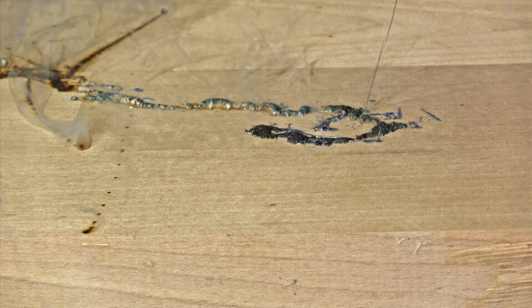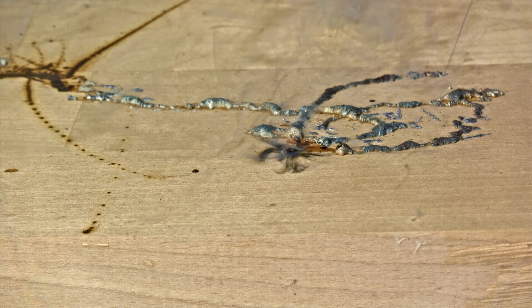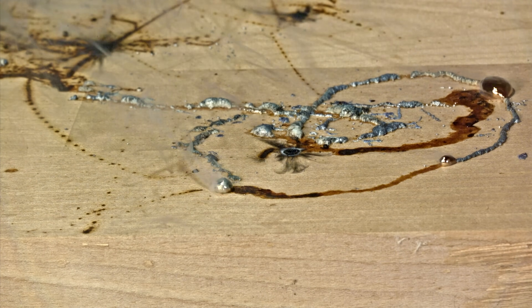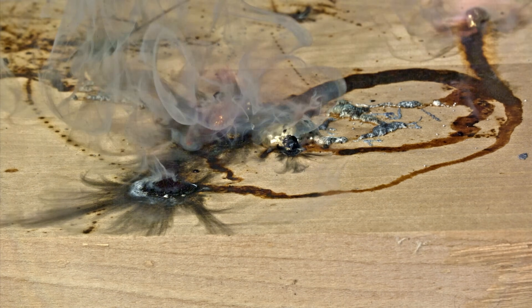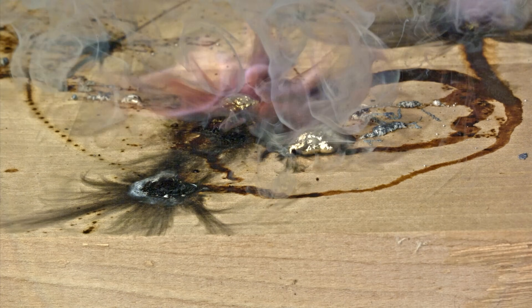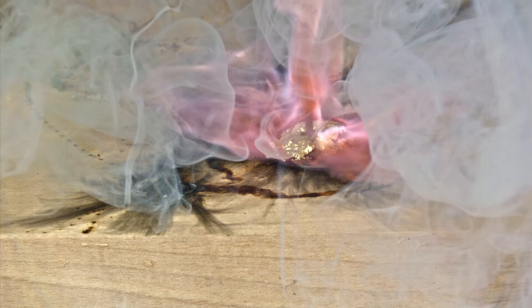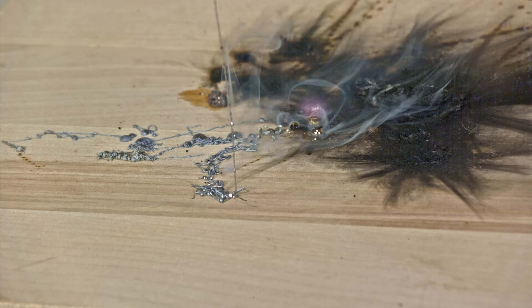Let's watch the combustion of this alloy in slow motion. Notice how the initially perfect liquid stream turns into a brittle wire after contact with air. I really like this purple flame, so I've added a few shots.